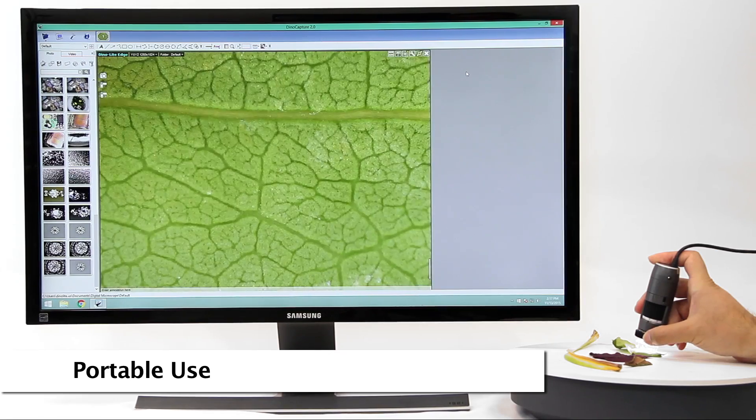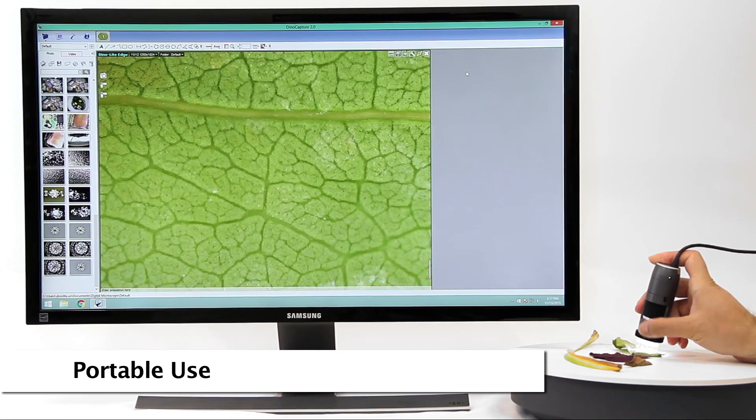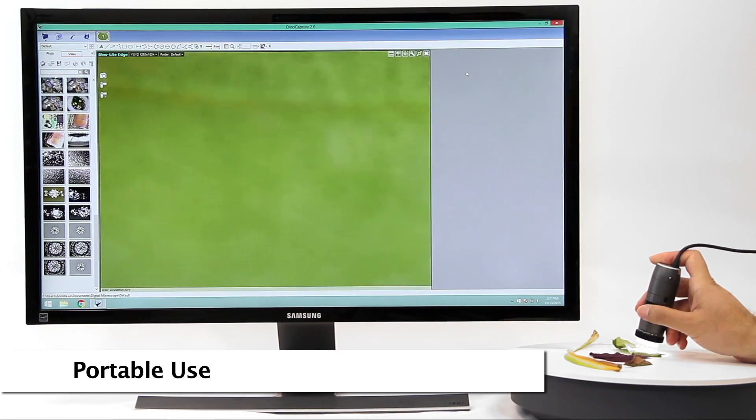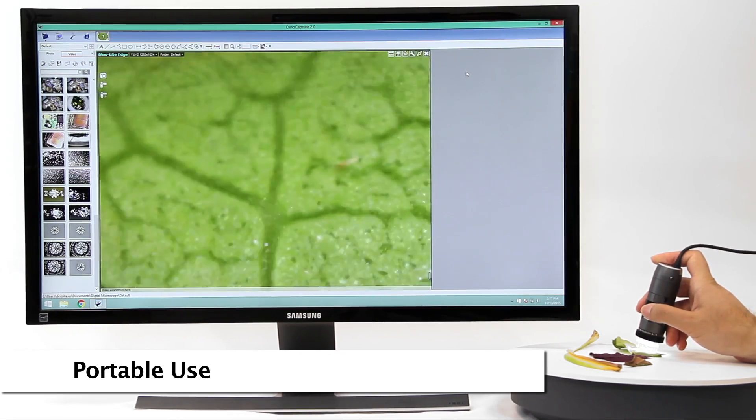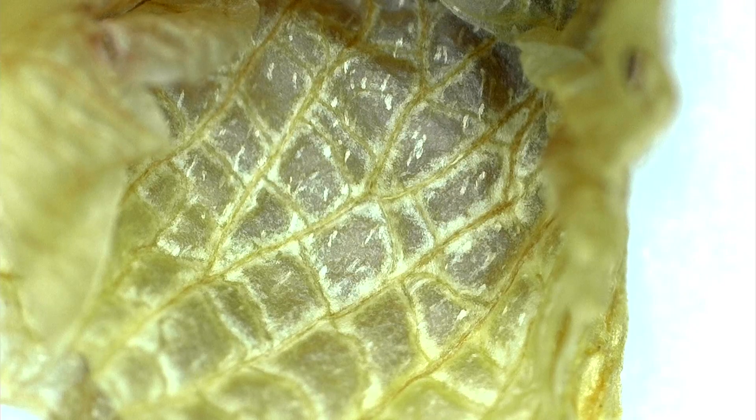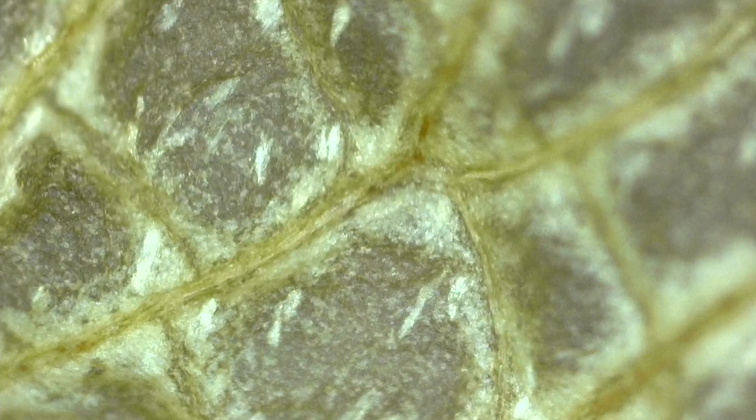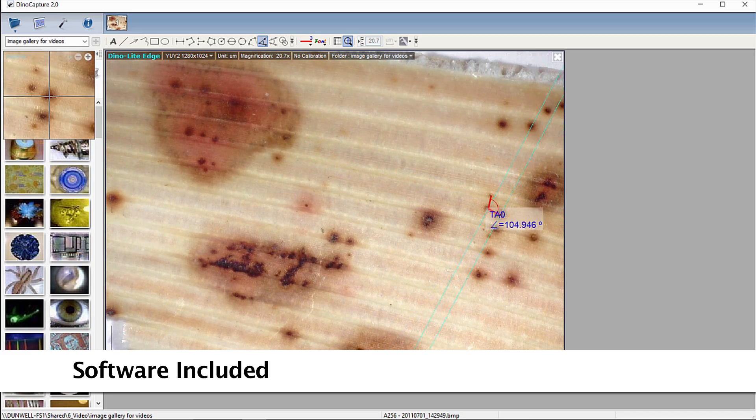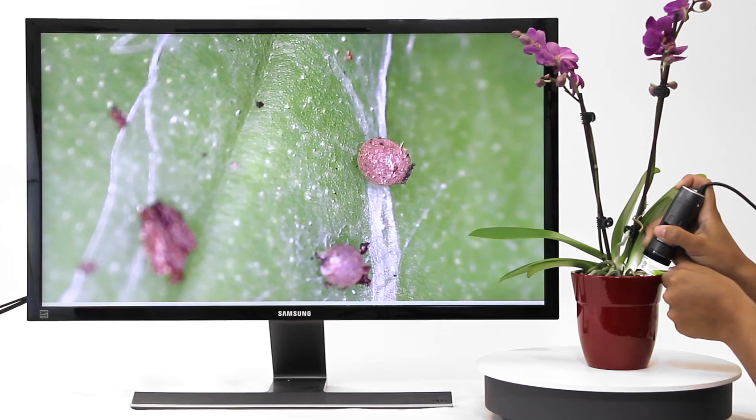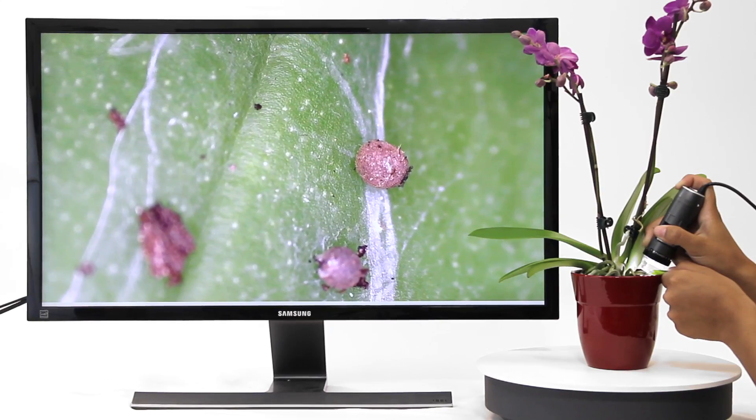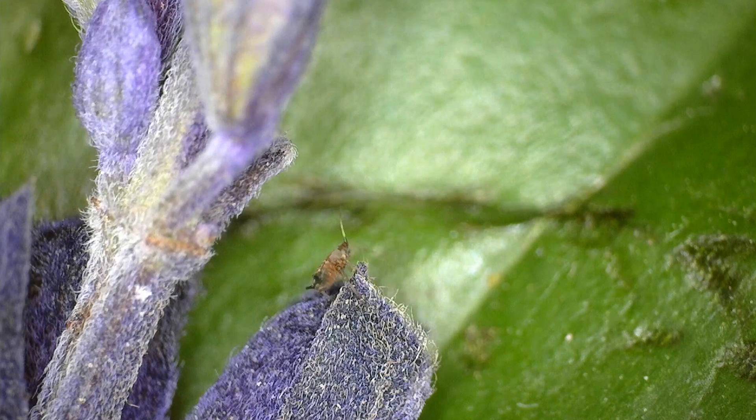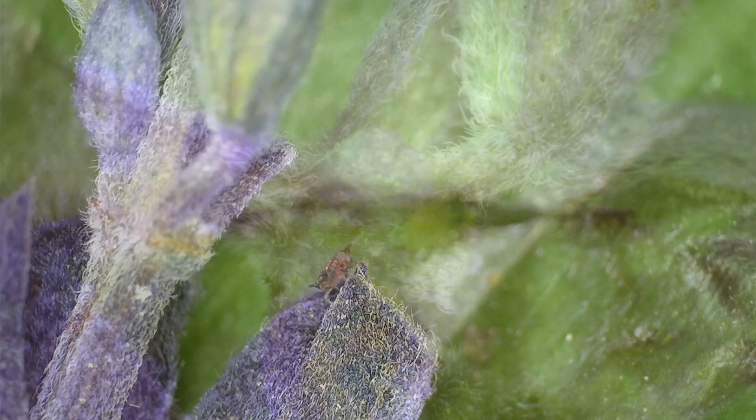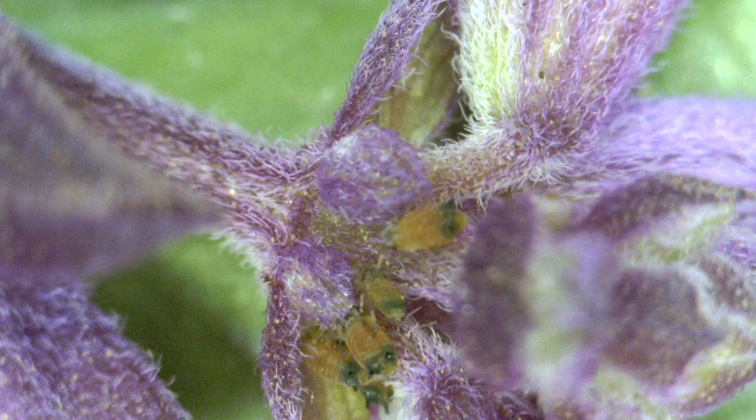The Dynolite is a handheld microscope camera with most standard models going up to 220 times magnification. USB models connect to a computer and include easy to use software that allows users to capture images and video, as well as many other basic and advanced features.